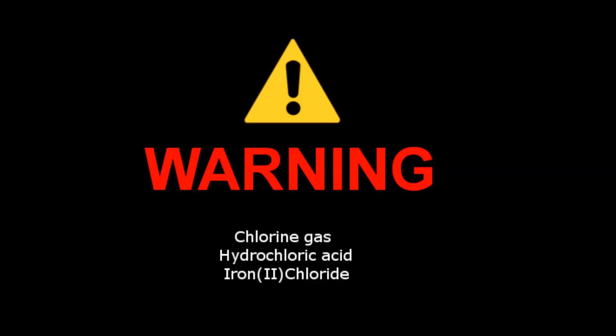Warning, this experiment uses a lot of chlorine gas. Even short-time exposures at low concentration can cause irritation and respiratory distress. It's a strong oxidizer which may react with flammable materials. Hydrochloric acid and iron(II) chloride are both corrosive and must be handled with care. All parts of the experiment must be performed under a fume hood.